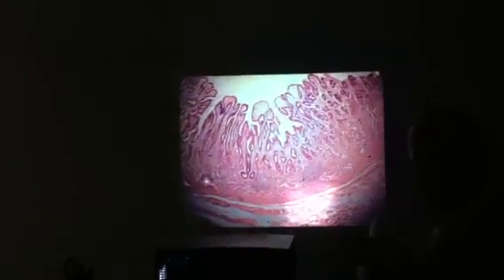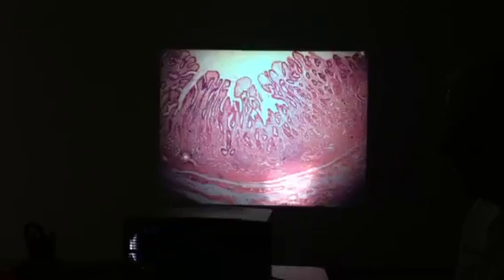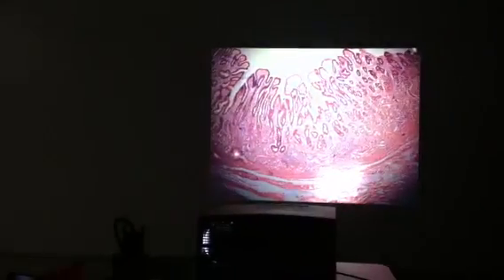And what did I do in my Rust book? Did you look up the stomach? It's right there. You got the stomach? All right, pyloric region, yeah, good. Tess, don't you let me knock that box of slides off. That box over here.